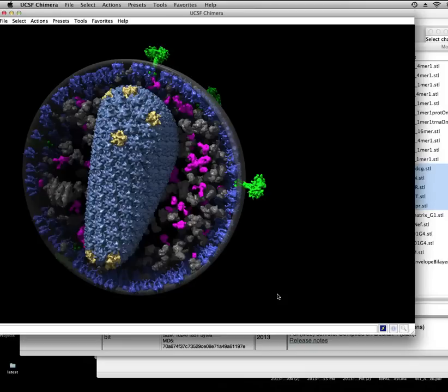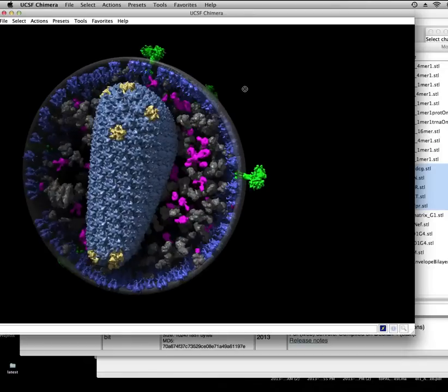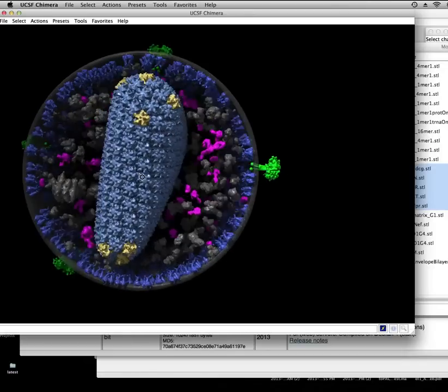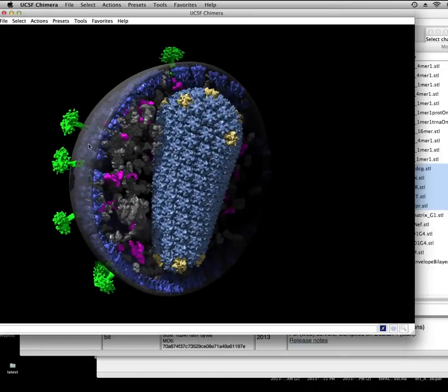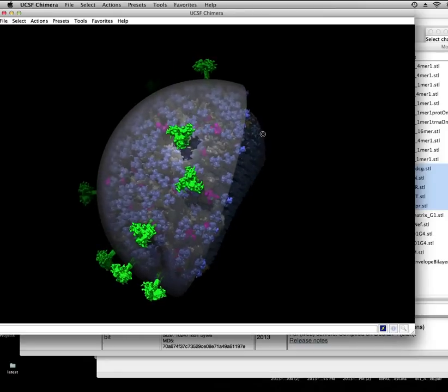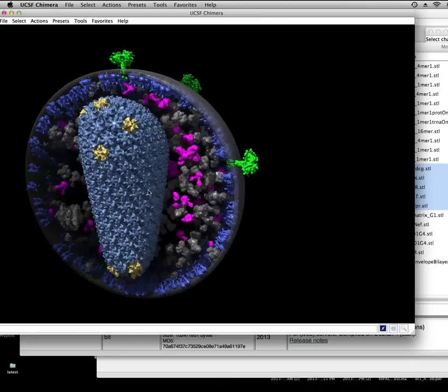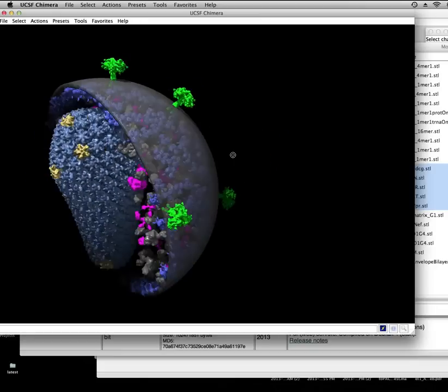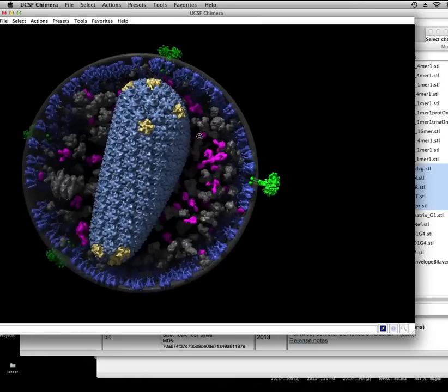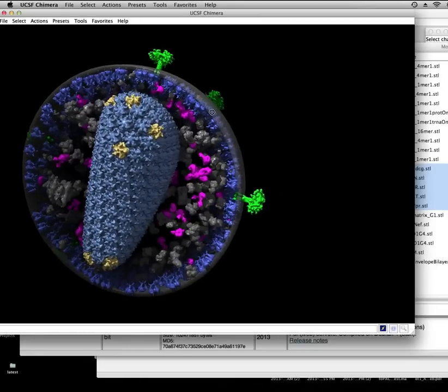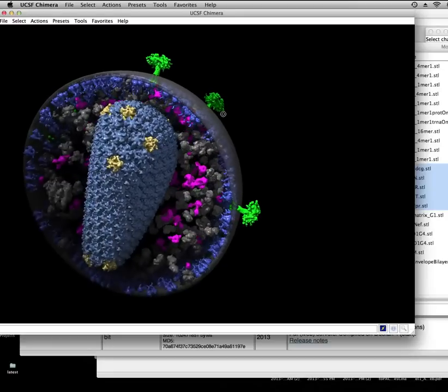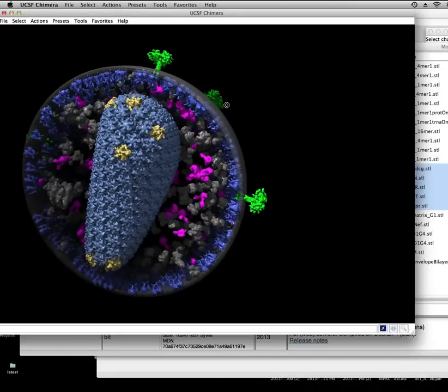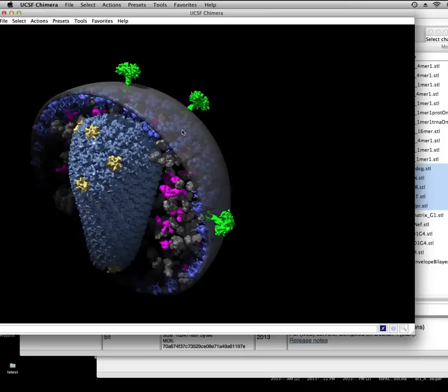I just showed you how to install the correct version of Chimera to be able to view AutoPak result files, such as this HIV model that I'm spinning around here. Now I want to show you how to load files using this relatively simple and intuitive AutoPak result file reader that's built into Chimera.